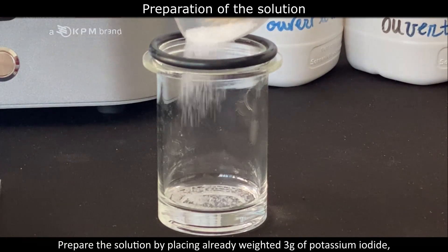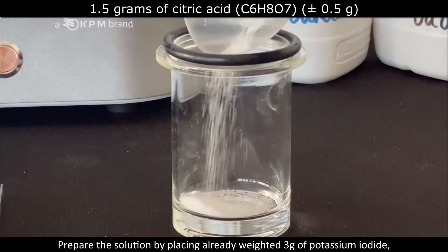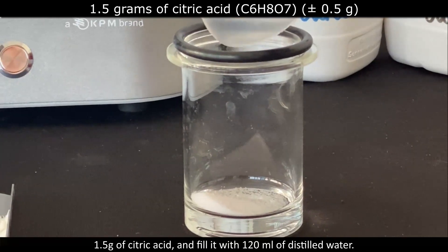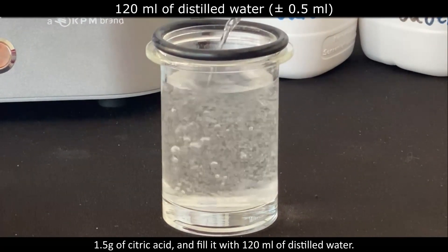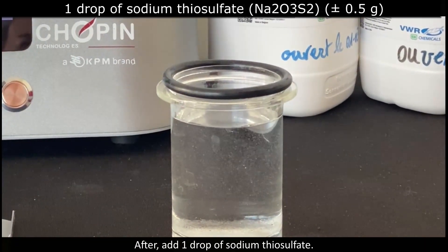Prepare the solution by placing the already weighed 3 g of potassium iodide and 1.5 g of citric acid, then fill it with 120 ml of distilled water. After that, add 1 drop of sodium thiosulfate.